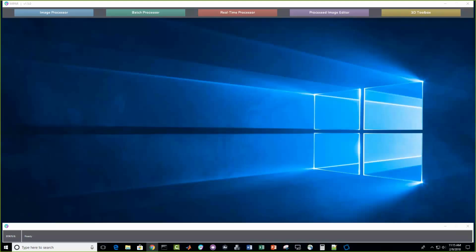So yeah, basically I'm using MIPAR, and I can very fast process a huge amount of data, and MIPAR basically plays the role of feature extraction, because we are using machine learning, and you need to extract very meaningful features, and this is the most important step for your machine learning tasks, especially when you do classification. So MIPAR has been very instrumental in my research, and I have been publishing.